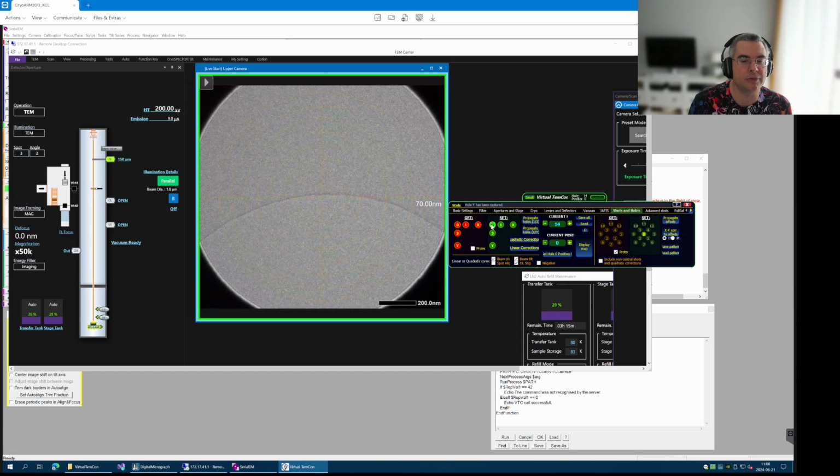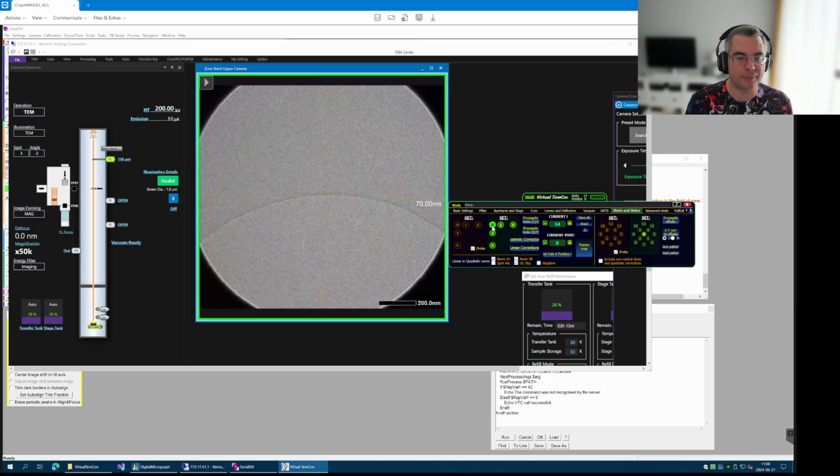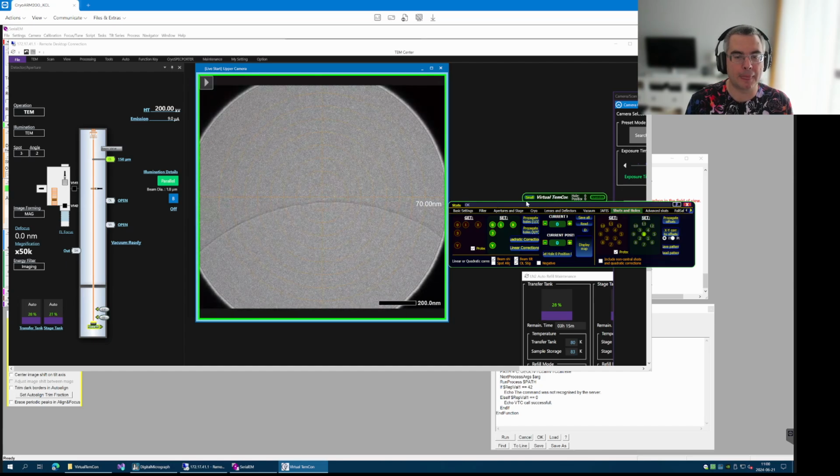So I now have hole 0, X, and Y, so long distances measured, and I can calculate the correction factors by clicking on the propagate holes X, Y. And then it says done. At this point, we are done with it. So just to test it, we are now at hole 0.